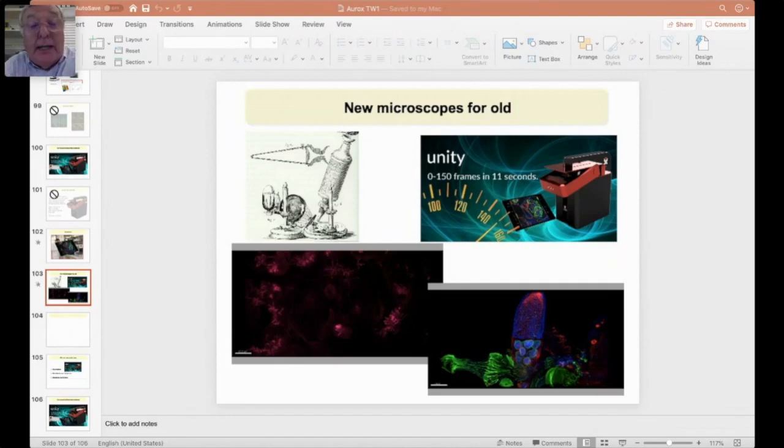It didn't catch on in the way in which the acoustic microscope didn't catch on. Really, all the optical microscope can do is measure refractive index. Well, frankly, who cares? The acoustic microscope, on the other hand, does measure serious material properties.